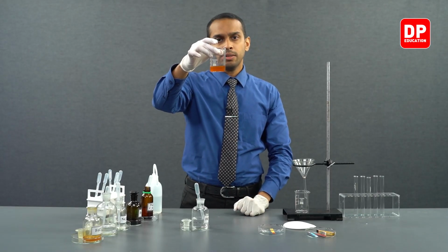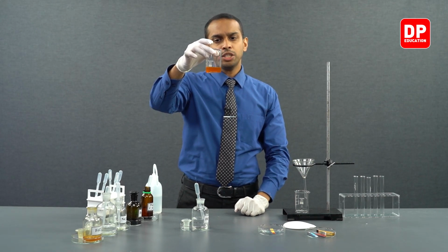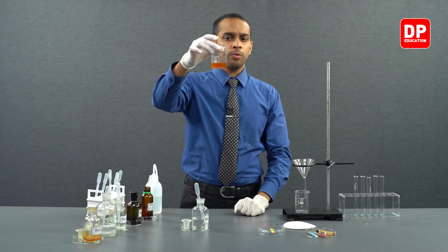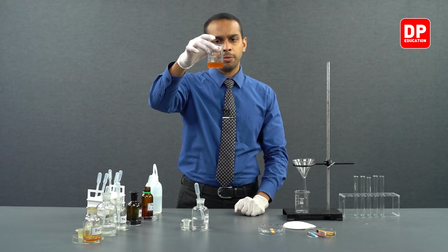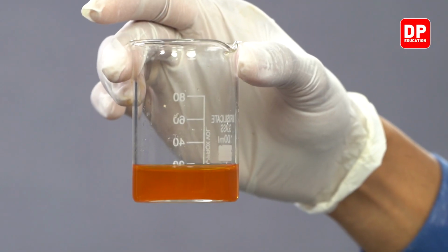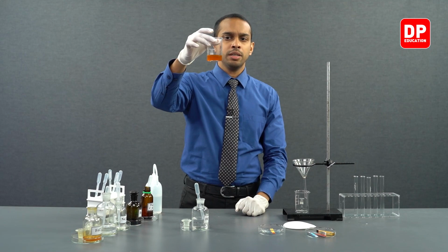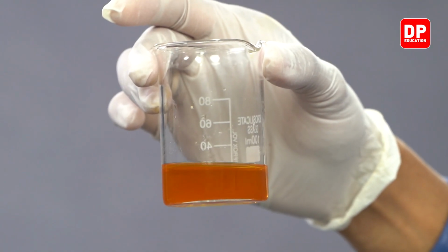But after all of the H plus ions are removed from the medium, the additional ammonium hydroxide that is added to the medium will give us a brown color ferric hydroxide precipitate. This indicates that we should stop adding ammonium hydroxide and start filtering the solution to obtain the neutral ferric chloride solution.